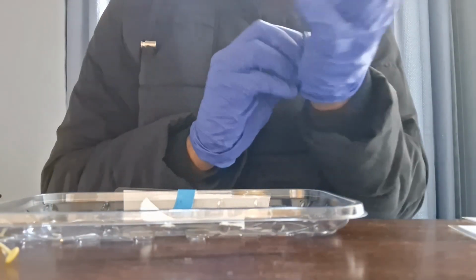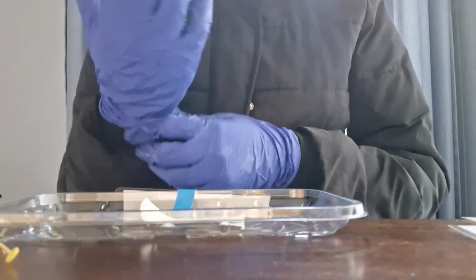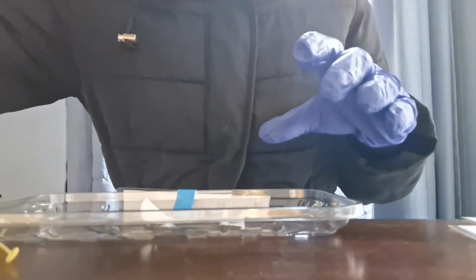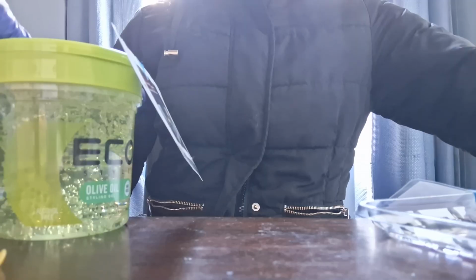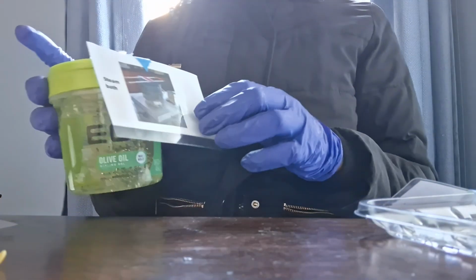What we are going to do next is use a steam bath. This will act as a steam bath. So I'm going to put this tray aside and put it on here. Let's assume that this is the steam bath.